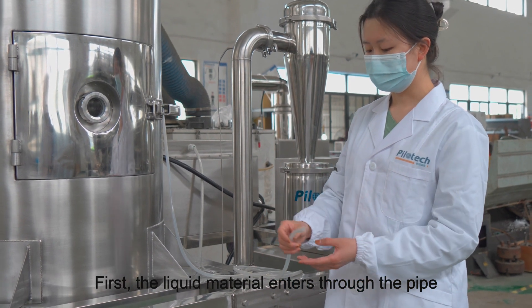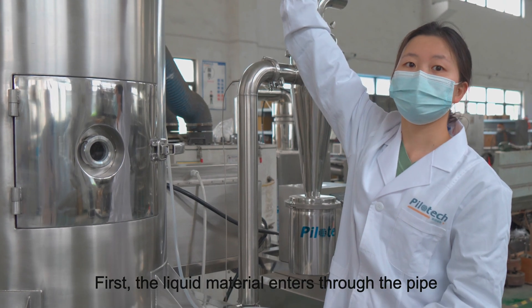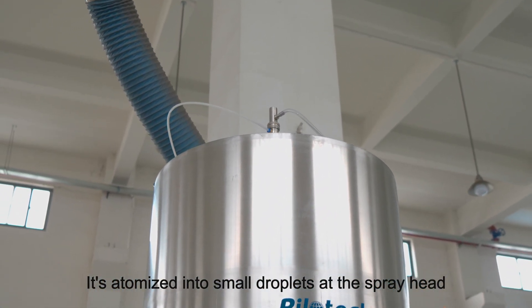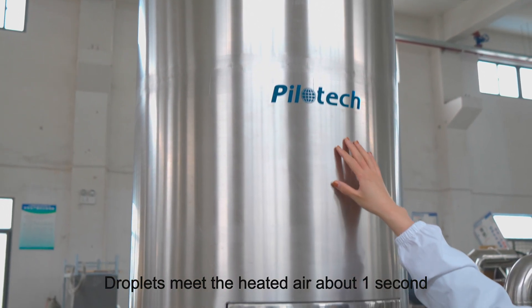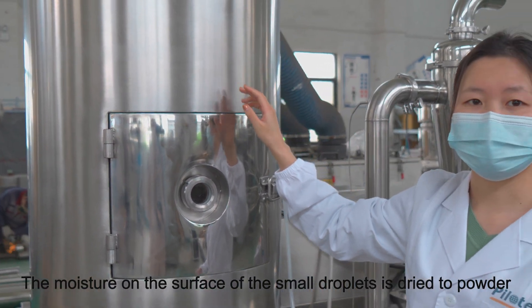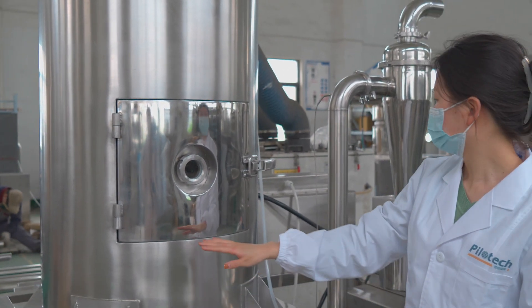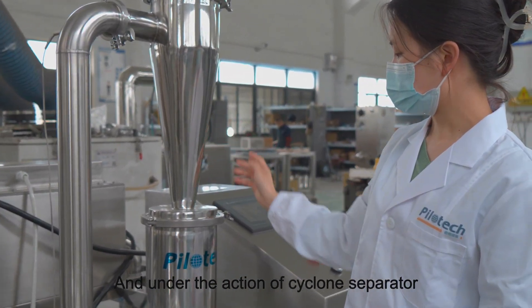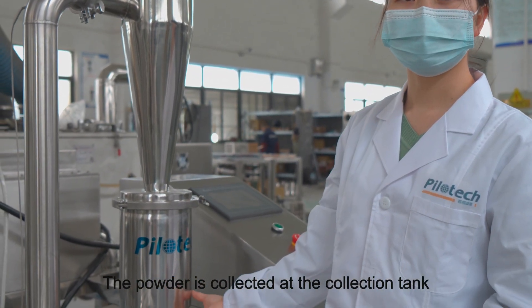First, the liquid material enters through the pipe. It's atomized into small droplets at the spray head. Droplets meet the heated air for about one second. The moisture on the surface of the small droplets is dried to powder, and under the action of the cyclone separator, the powder is collected at the collection tank.